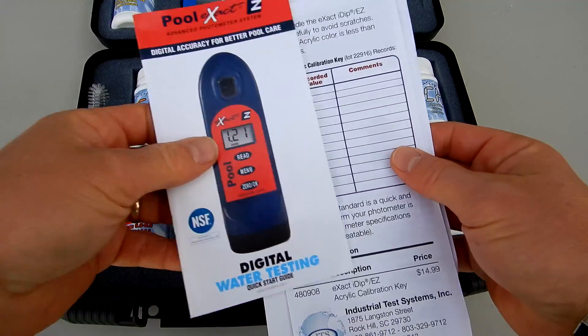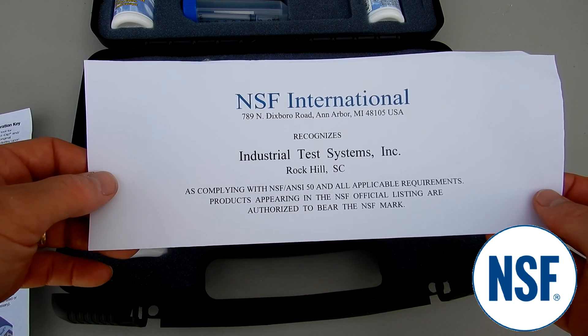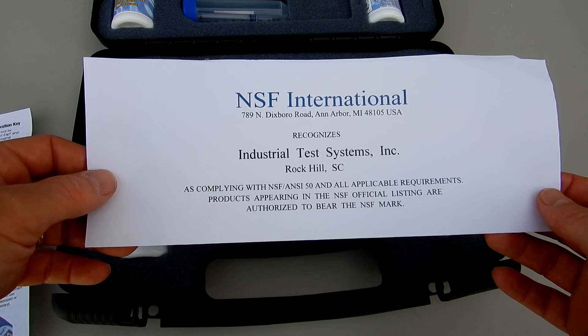Included is the manual. You also have the NSF certification. This particular photometer is NSF certified, which means that it's been certified for commercial pool use.